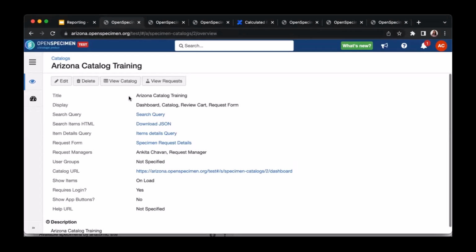No, that's not possible. Okay. But we could put instructions on how to send us those types of requests, through email or something like that. I think that would work on that page if they get to it.